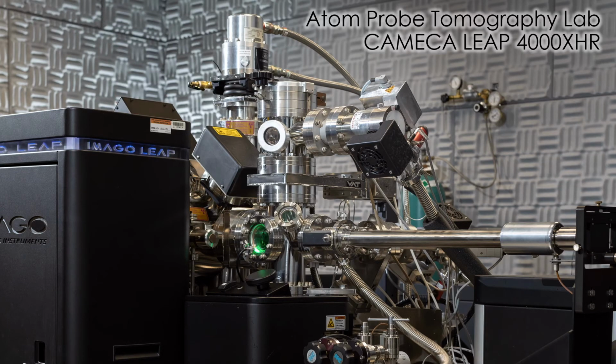The second lab houses the local electrode atom probe, which is a CAMECA LEAP 4000 XHR equipped with a reflectron lens. This is where we perform all of the atom probe tomography experiments.